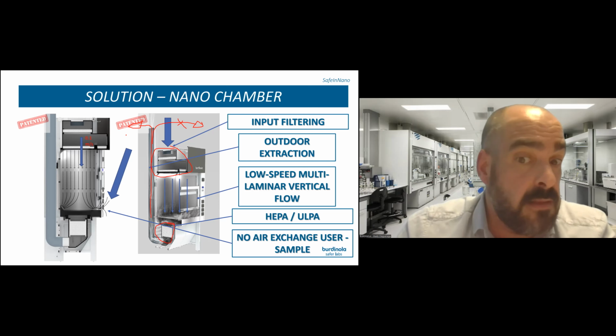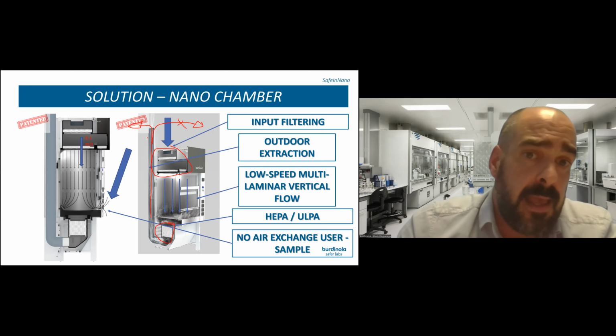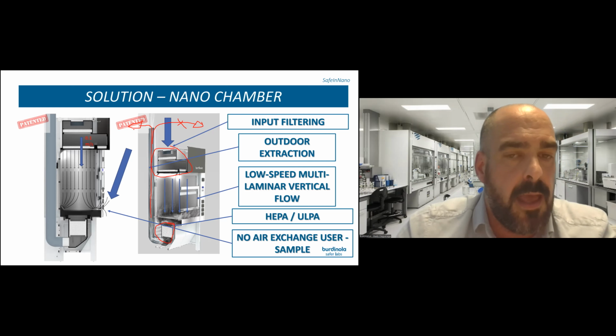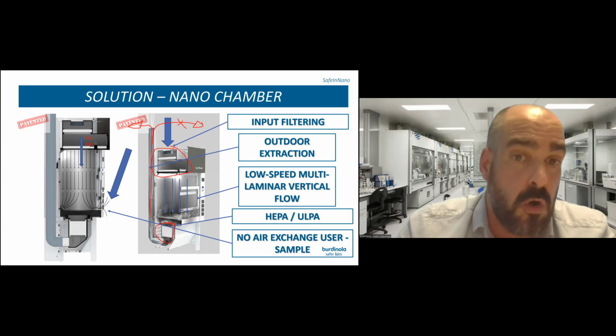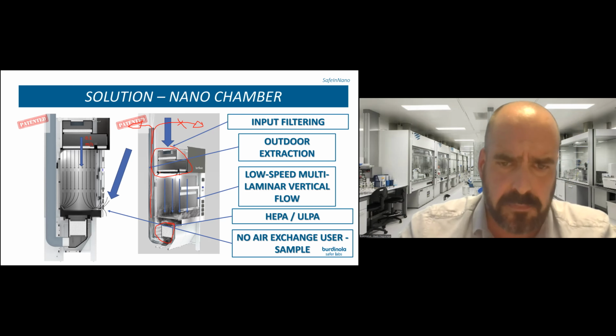I have said before that no filter is 100% effective, so we are cleaning the air here at 99%, so 1% of the particles are going outside. But as you know, the agglomeration of this kind of materials happens quite easily. So we are going from a nanoscale to a micro or milli scale outside, due to humidity and so on.